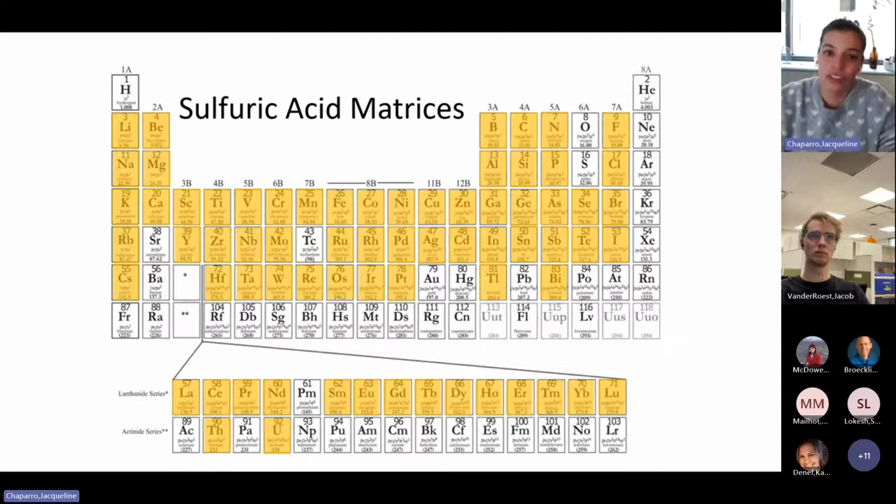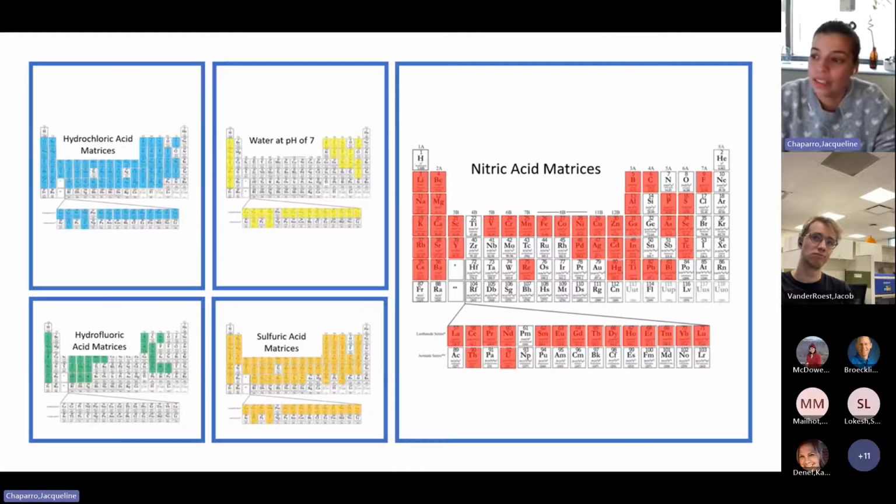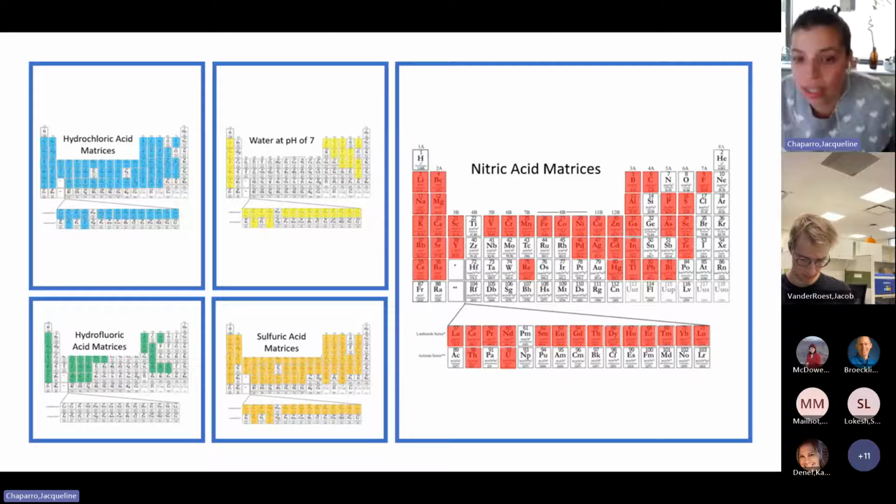Another acid that is used is sulfuric acid, but that is also just as messy and produces a lot of polyatomic interferences. But just so that you are aware of what can be done, sulfuric acid can also be used sometimes with digestion. So this is a summary of all the different acids across the periodic table, and like I said, the gold standard, or what we tend to like to use, is nitric acid, mainly because it reduces any of the polyatomic interferences.